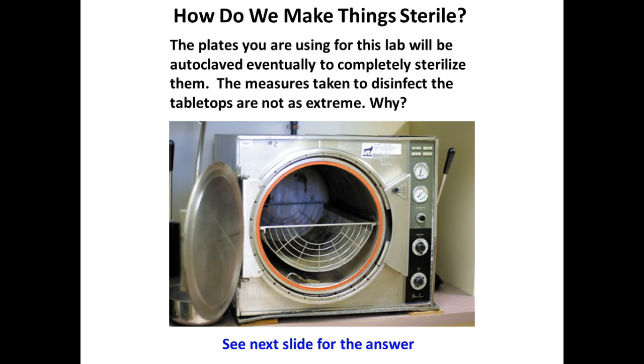So we do that. Any of the stuff that we contaminate or needs to be disposed of properly goes on that cart by the door, and Miss Paula comes around and takes it and autoclaves it and disposes of it properly. So that's our discard cart there by the door. Some people who use our lab put drinks on that cart. I'm like, that is the dirtiest place in this entire lab.